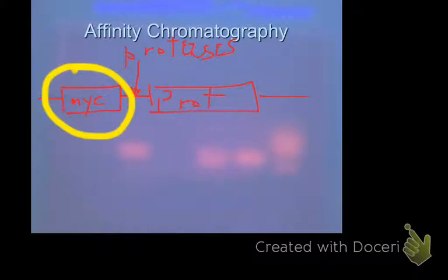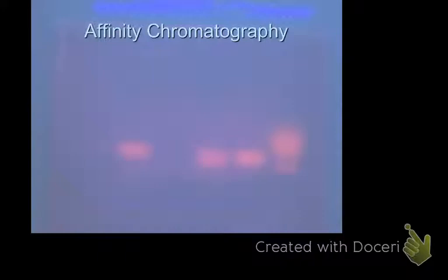and then somehow separate the protease from the protein. So that's another type of affinity. But the HIS tag is the one that I was wanting to talk about, because that one gets used all the time. What do you suppose the HIS stands for? Histidine. And once again, you clone it.